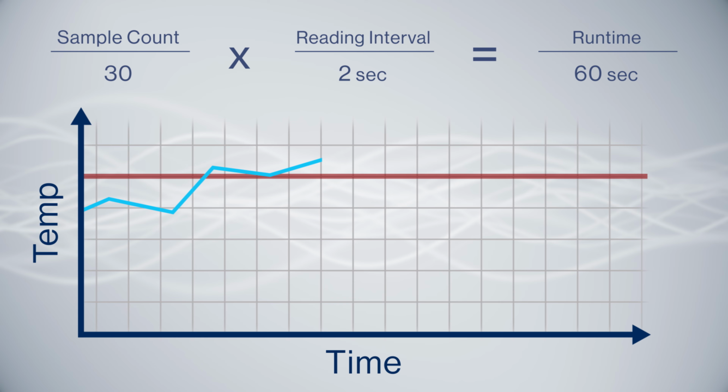In this video guide, we'll go over how to configure trigger settings to best suit your needs. To get to the trigger settings, go to your data logger's info page and tap the gear icon in the upper right corner to navigate to the data logger settings, and then tap on the triggers tab.